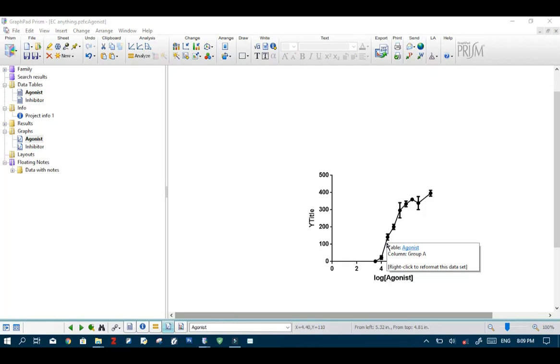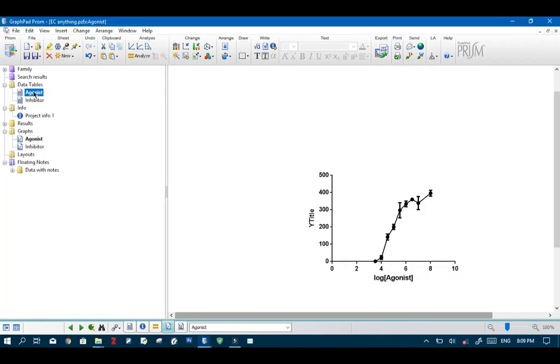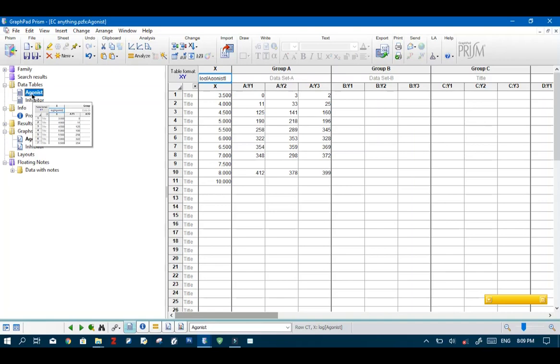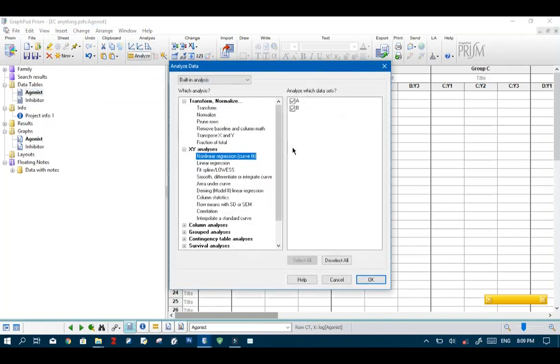The first thing you want to do is get your data into GraphPad Prism. Over here I've already pasted my data into GraphPad Prism. So the next thing you want to do is make sure that you've selected your data sheet and hit analyze.